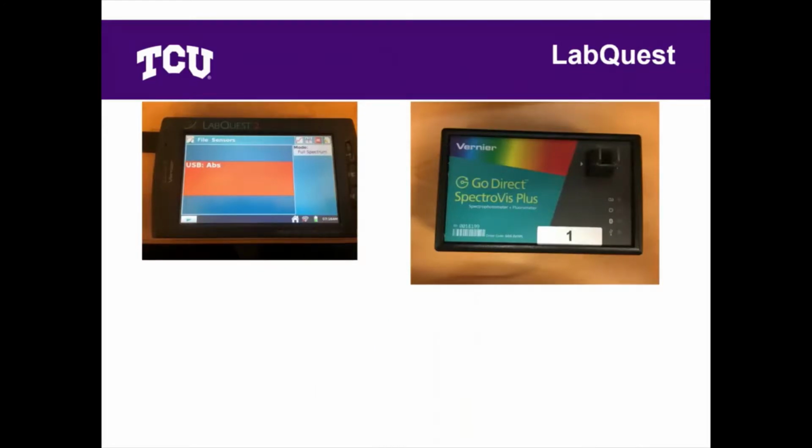For the LabQuest, you guys are going to be using LabQuest in this lab, and you'll be using spectrophotometers for the first time. So, LabQuest, pictured here, we will have this mostly set up before you come. But for the parts you do have to set up, here's your LabQuest and your spectrophotometer.